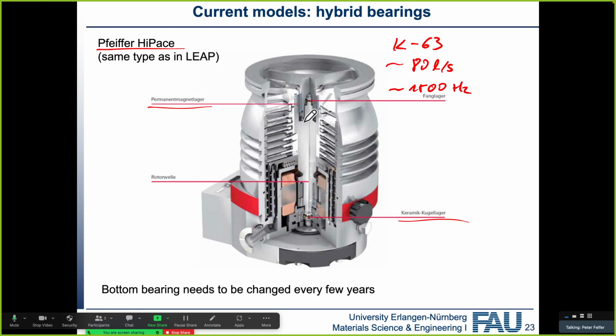Don't move it around when the turbo pump's running, although we have some systems where you could do that. For example, Olli Nagel's new system is currently on wheels, and the turbo pump's running. So if you go there and you shake it, that would be very bad. So don't do that.